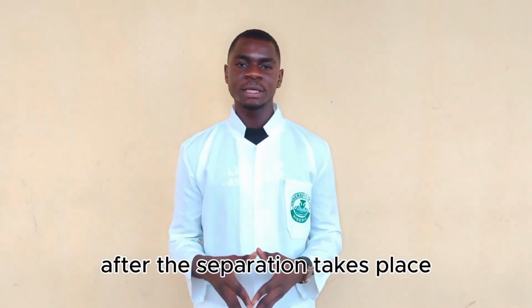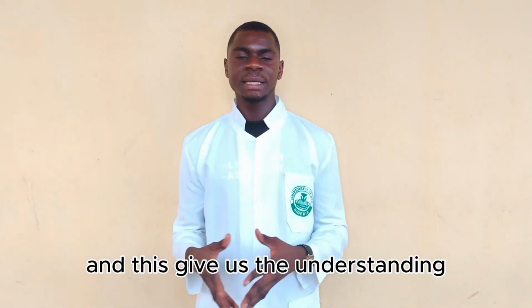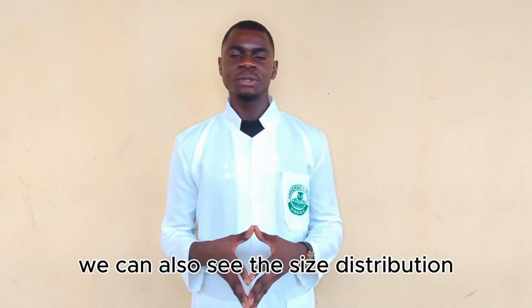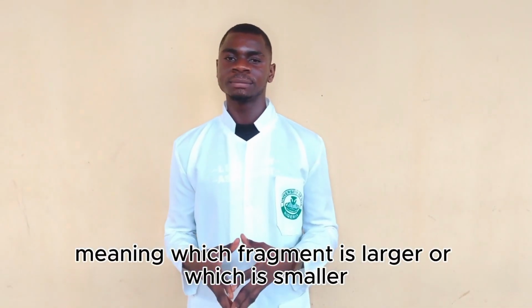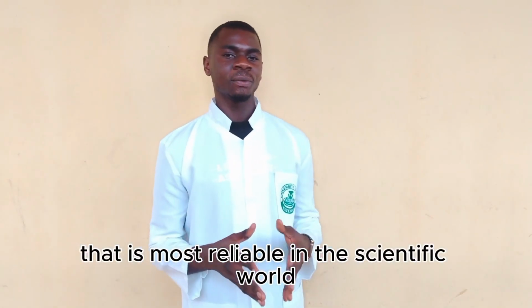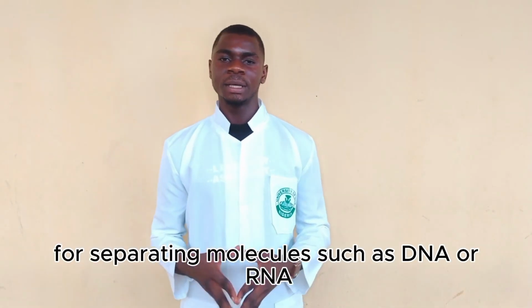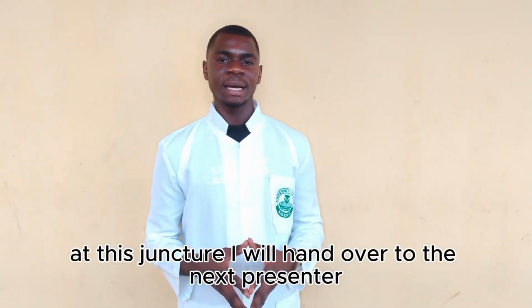After the separation takes place, the result can be visualized, and this gives us the understanding of what the nucleic acid we are working with looks like. We can also see the size distribution, meaning which fragment is larger or which is smaller. Agarose gel electrophoresis is a highly reliable technique in scientific work for separating molecules such as DNA or RNA.